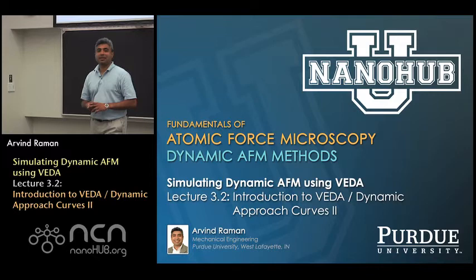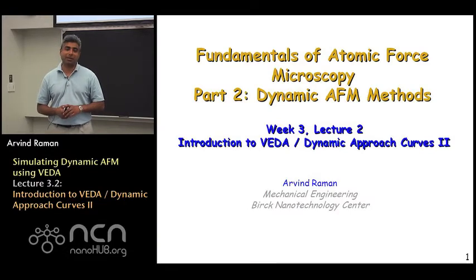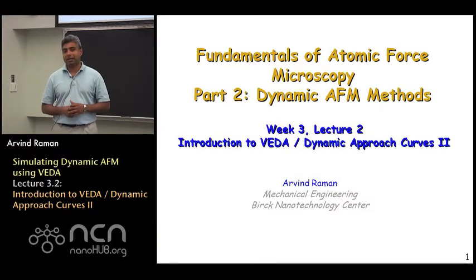nanoHUB-U, online instruction. Hi, and welcome to Week 3, Lecture 2 of Dynamic Atomic Force Microscopy Methods. In this Week 3, we are focusing on online simulations using VEDA, which allows us to do numerical experiments in a very realistic setting of dynamic atomic force microscopy.